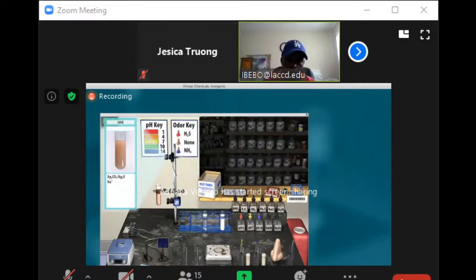Well, you added sodium carbonate, so it looks like what is going to be trading places will be the nitrate and the carbonate. So that product there will be Ag2CO3, which we call silver carbonate. Okay. And then the next thing there will be plus sodium nitrate.